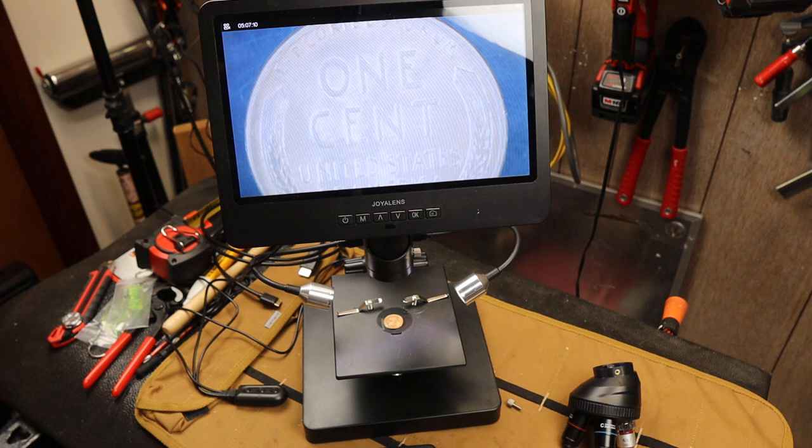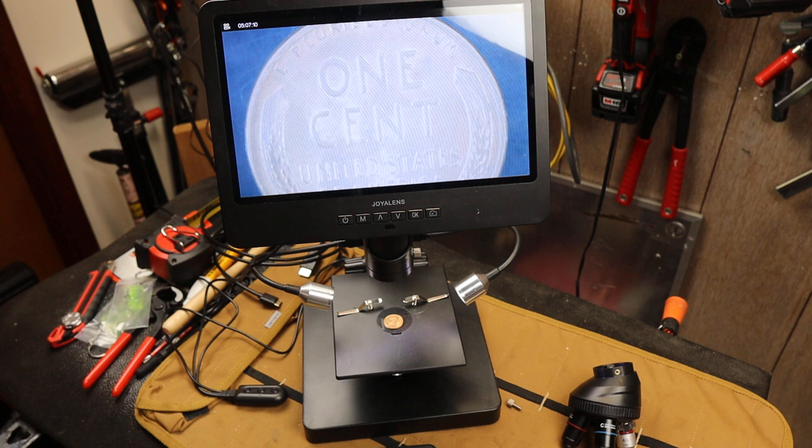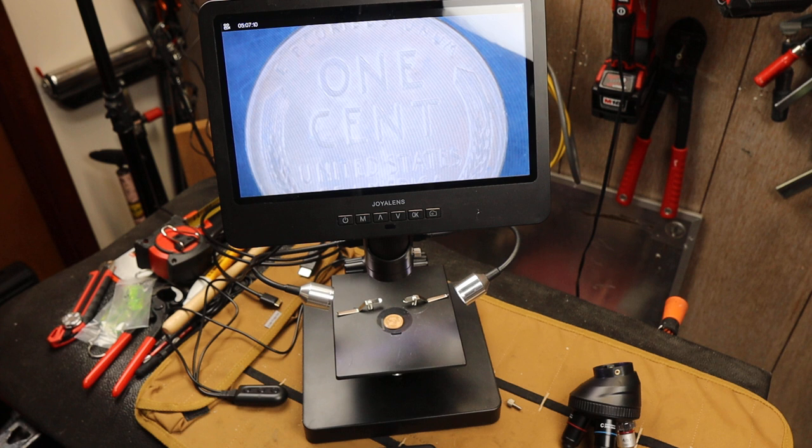Or down to a regular HD at 120 frames a second, shooting at 1280 by 720.